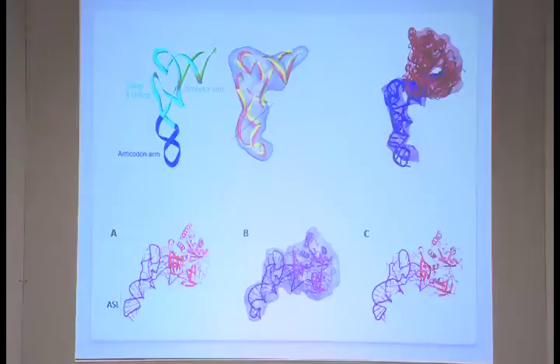One structure we got was of the EF-Tu-bound tRNA interacting with the ribosome, first when it comes and delivers the tRNA. It was about a 15 or 16 angstrom map, and we really couldn't model or fit the tRNA part. It has a kink-like structure. Even at that resolution we could make it out, but it was difficult to tell whether it was some low resolution density we were getting.